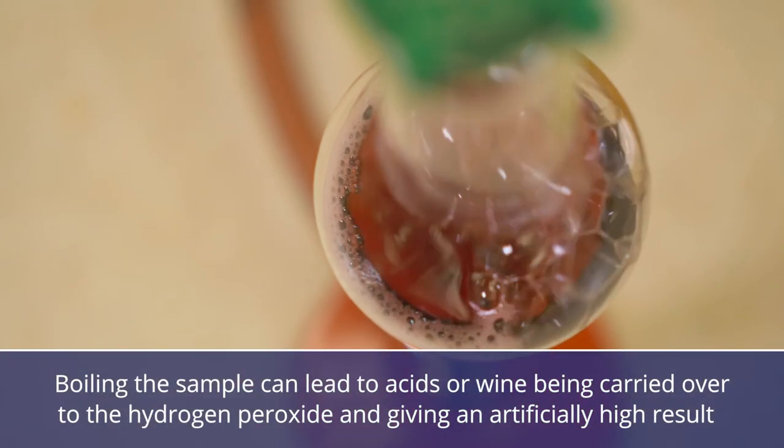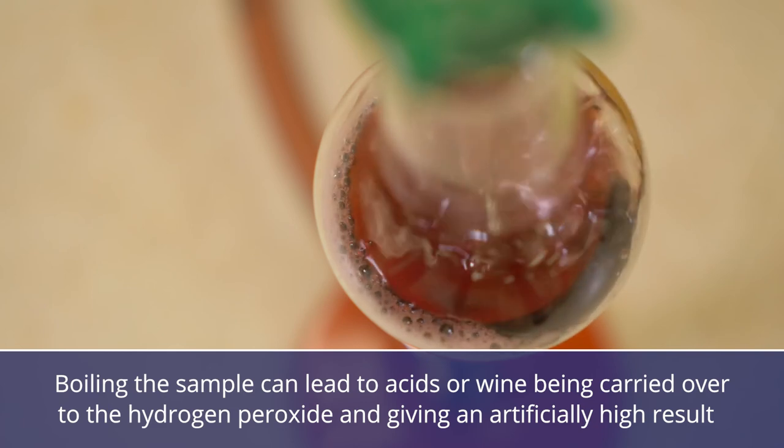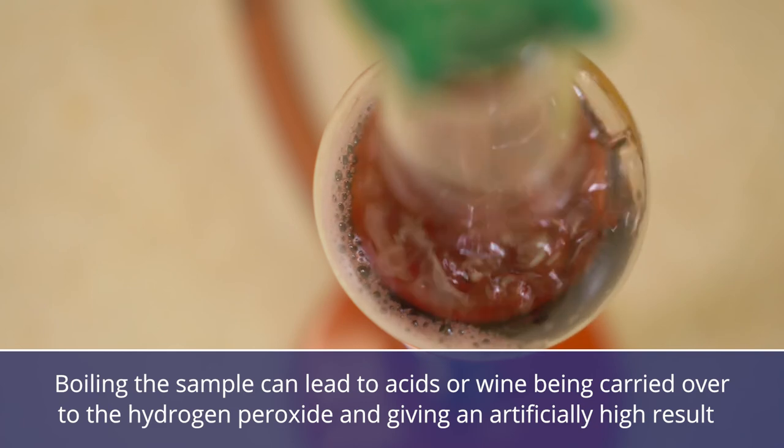Boiling the sample can lead to volatile acids or droplets of wine being carried over to the hydrogen peroxide and giving an artificially higher result.